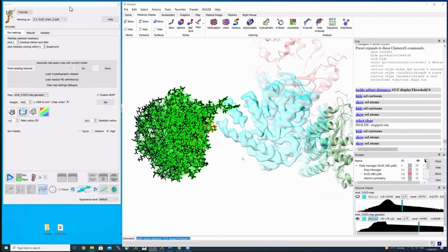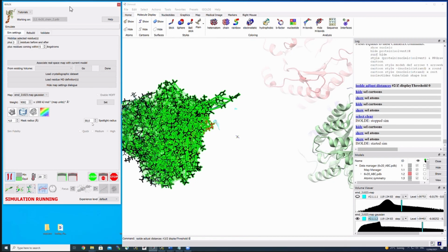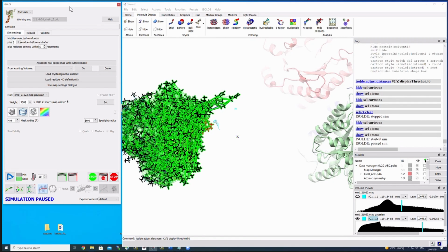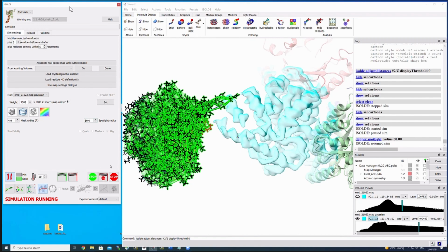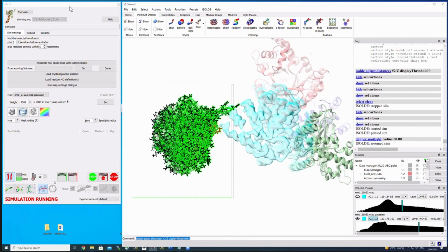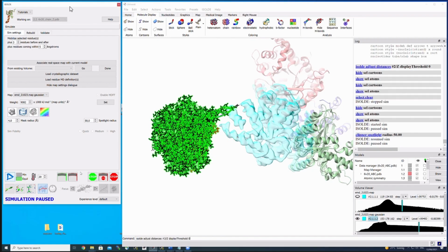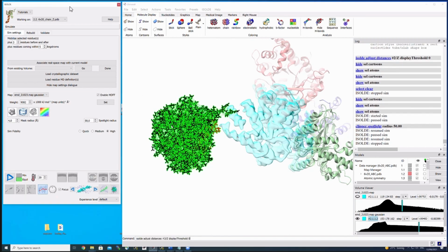I will start the run, and you can actually see how some residues are flipping, although we have these restraints applied. So when you do this kind of thing, there are 2 options to recover from this. We tug the domain and we essentially, okay, now I didn't select everything properly, obviously.